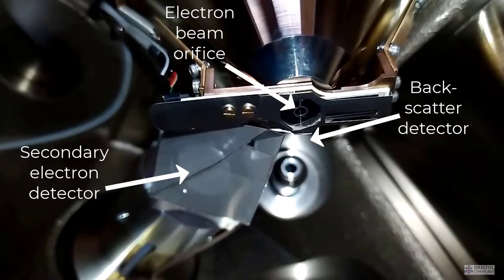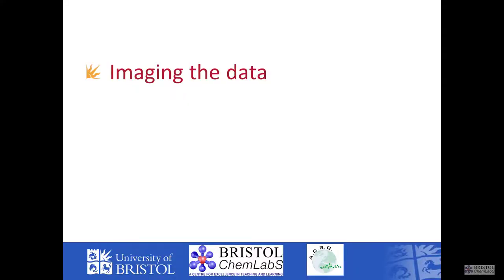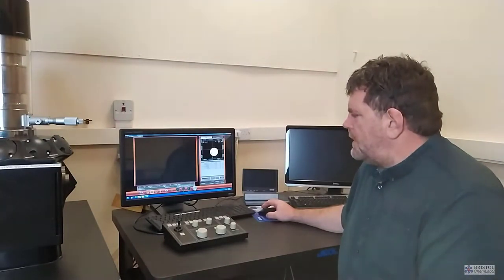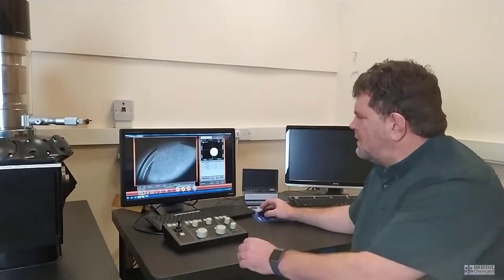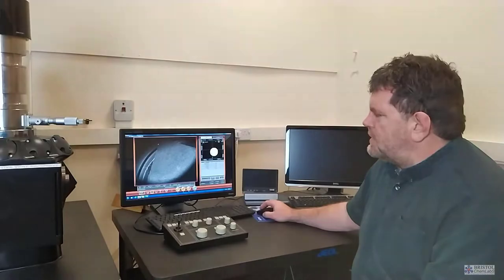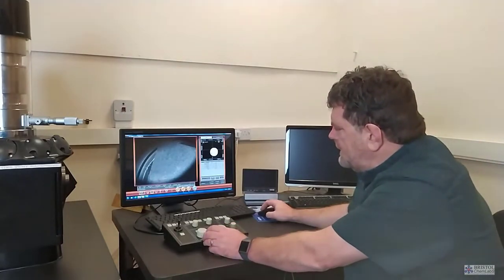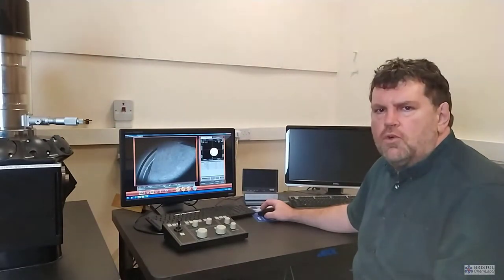Once we've loaded the samples into the microscope, we just click on the electron beam and it slowly warms the filament until we start seeing an image appear on the display. What you can see is a grayscale image, this is just the corner of a slide with a sample on. We're currently at a magnification of about 16 times, similar ranges to what you would get with a normal optical microscope.